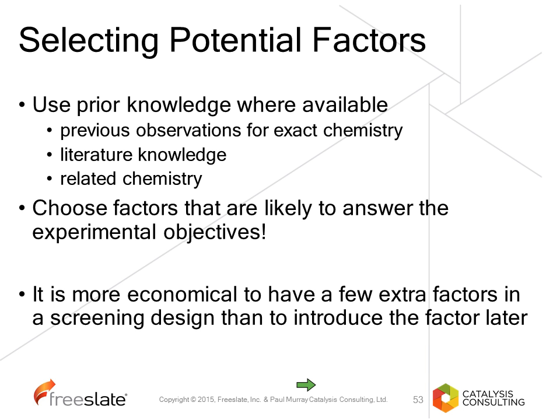It's important that you choose factors that are likely to answer your experimental objectives. If you're trying to get a more sustainable process, then you don't want to use damaging reagents or very toxic solvents. If you're trying to get a cost-effective process, you can use catalytic processes, but the catalysts have to be at extremely low levels or be recycled efficiently. So there is no point in looking at a process which is stoichiometric quantities of a very expensive reagent if your cost is a significant factor or response you're going to have.